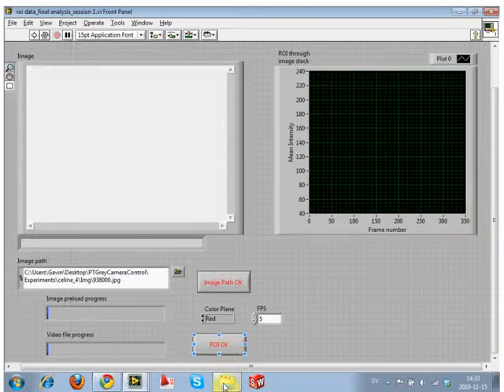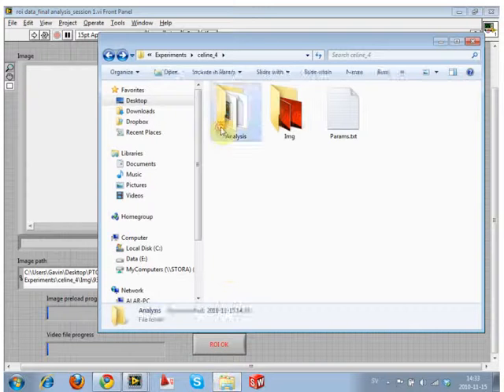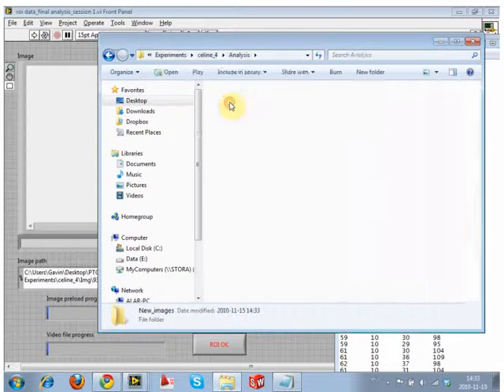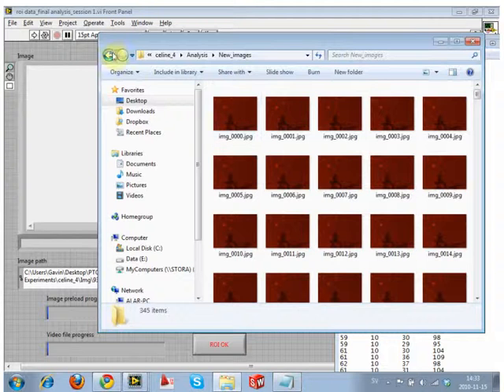This has data in it. This has images in it. And our video has an overlay on it.